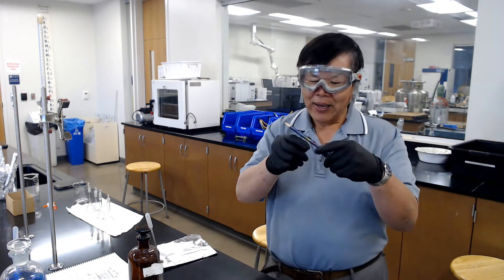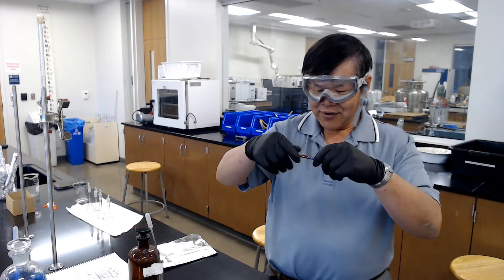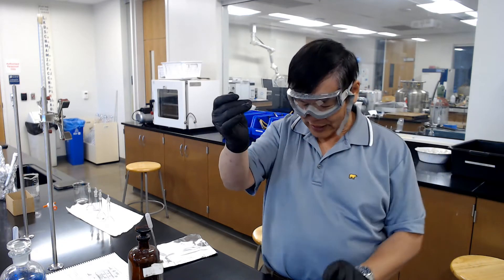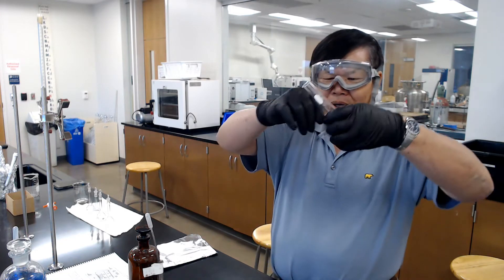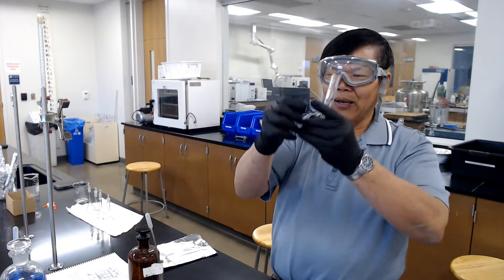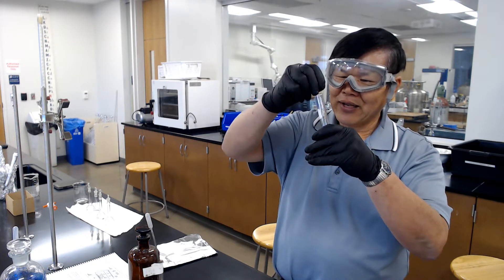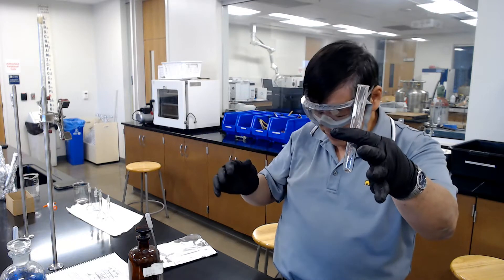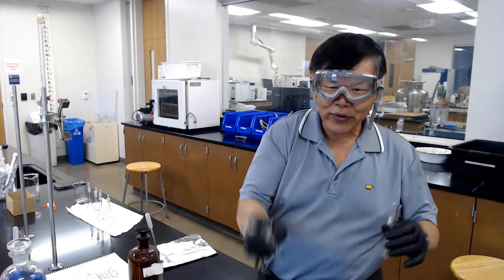Get a pencil and wrap the copper wire into a coil. Then take the test tube and stretch the copper wire coil to about half the length of your test tube, and shove it in. Do that for all three tubes.